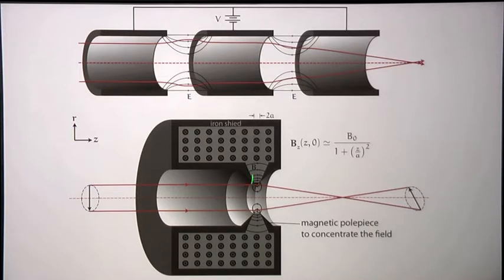So we basically don't use these. We use these. This is just a coil of copper wires in a cylinder, and the current going through all of these wires generates a magnetic field. We wrap it in iron like this so that the magnetic field is concentrated right at the center of the lens, and this is called the pole piece. It's here where the magnetic field pushes on those electrons and forces them to change their path.